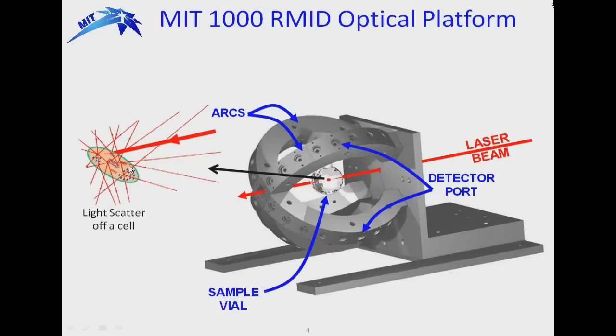When the cell does pass through the laser beam in the common region, the cell scatters light radially throughout the surrounding space. The light does not simply reflect off the cell. The light penetrates the cell, interacts with all of its parts and features, sending light in all directions in a way that is characteristic to its genus, species, and strain. Some of the scattered light is captured by and measured by the light detectors, digitized, and then passed on to the computer.